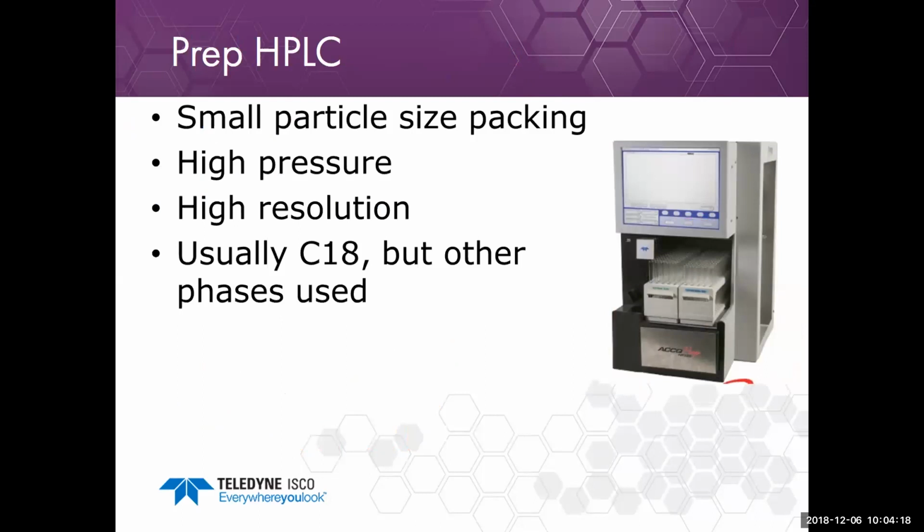Preparative HPLC uses small particle sizes. It uses high pressure. You get higher resolution. It's usually C18, but other phases can be used as well. The image over here is the AccuPrep system, which is for preparative HPLC only.